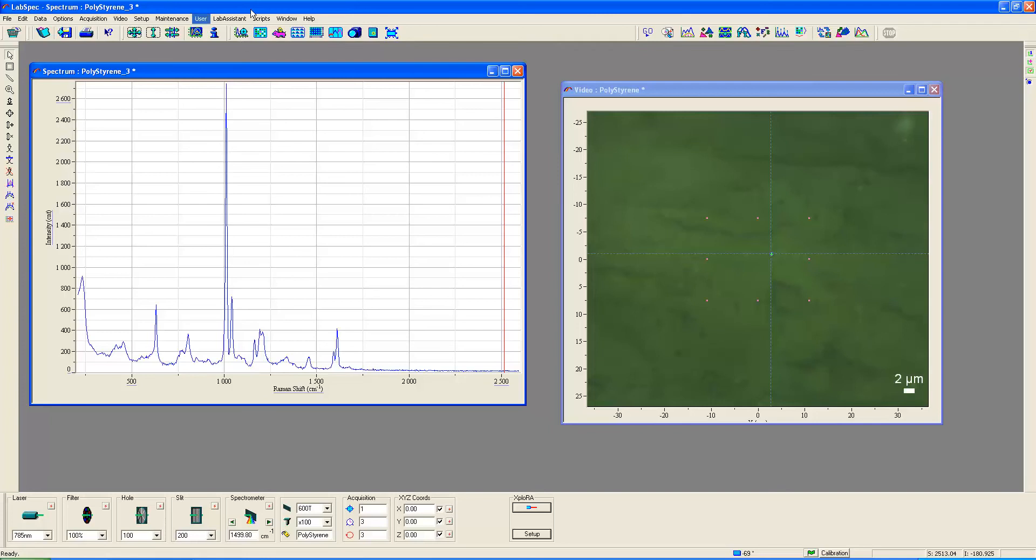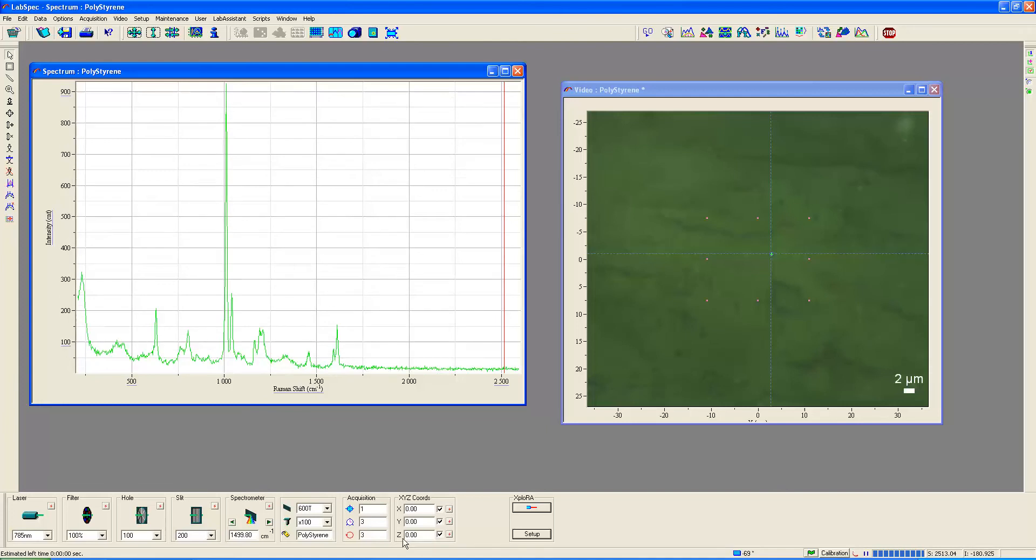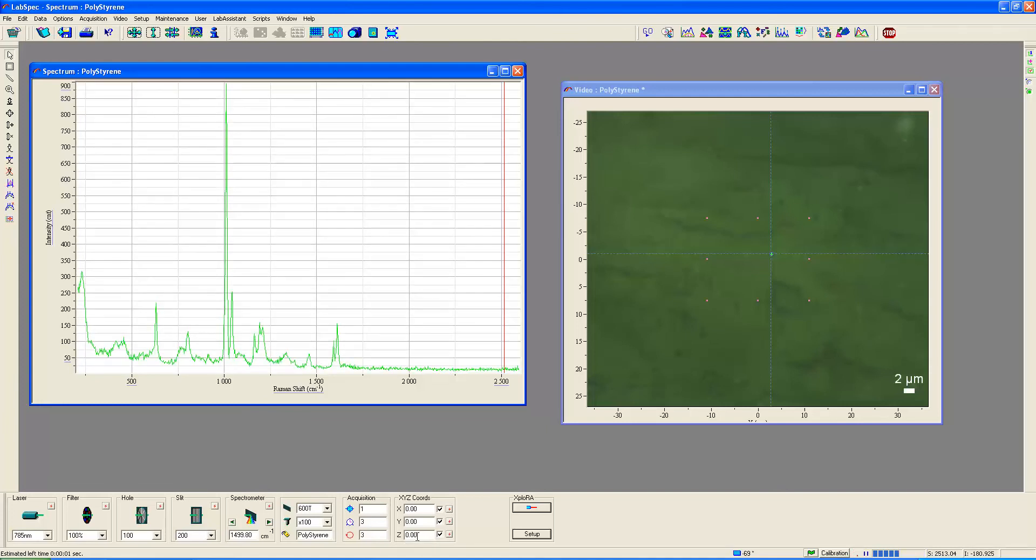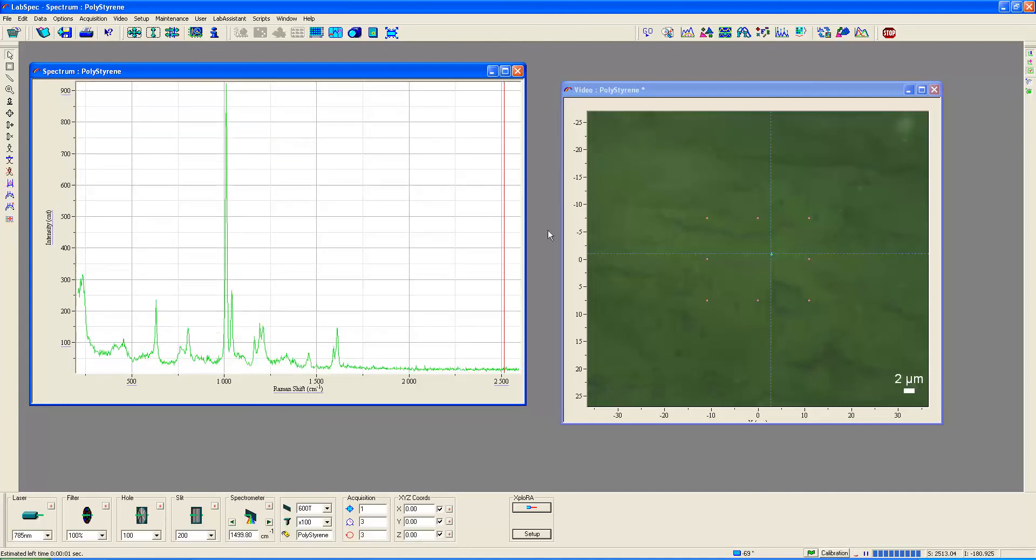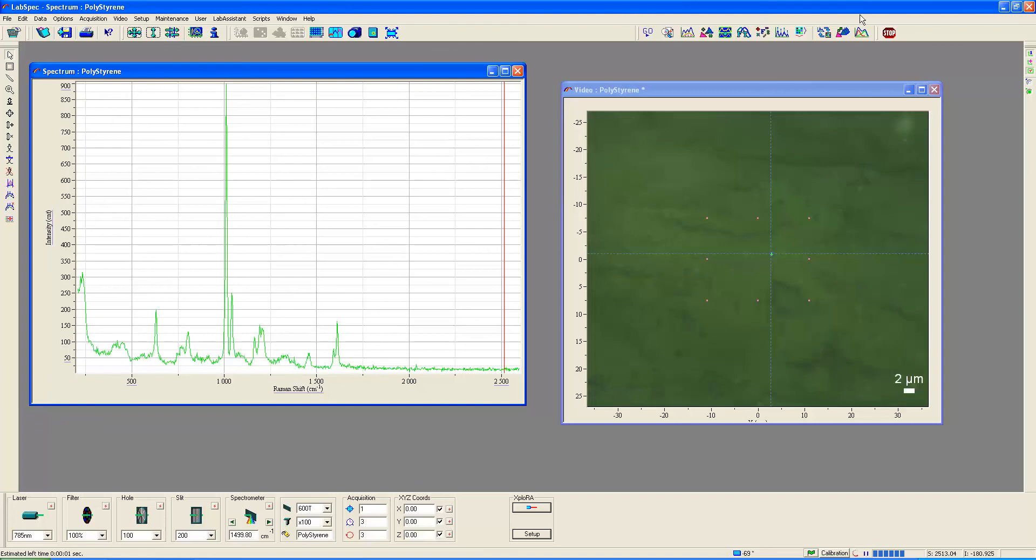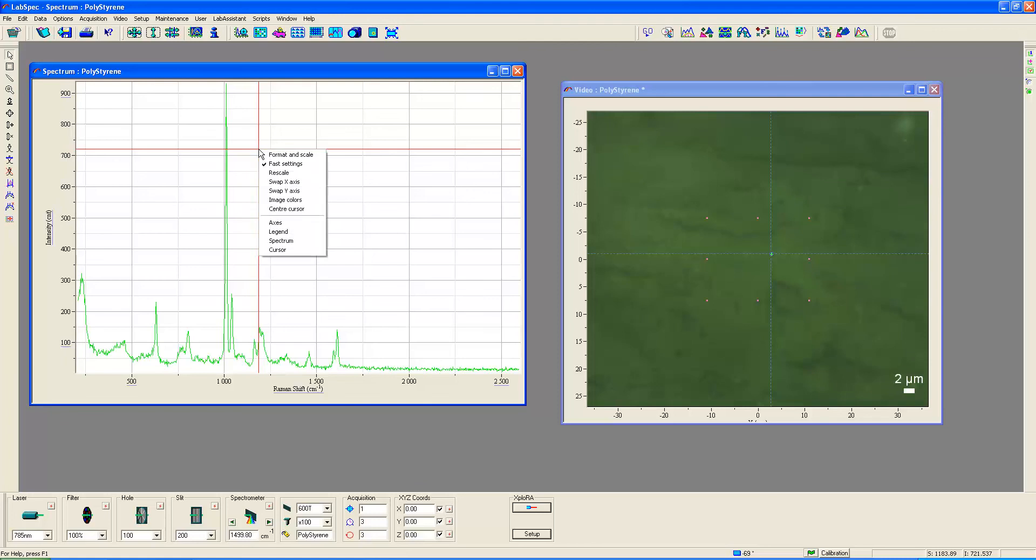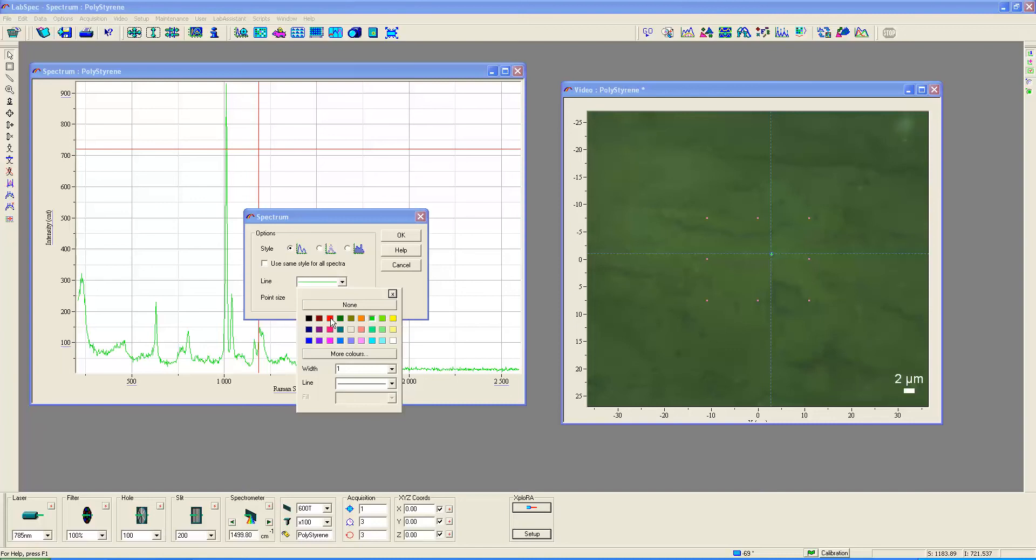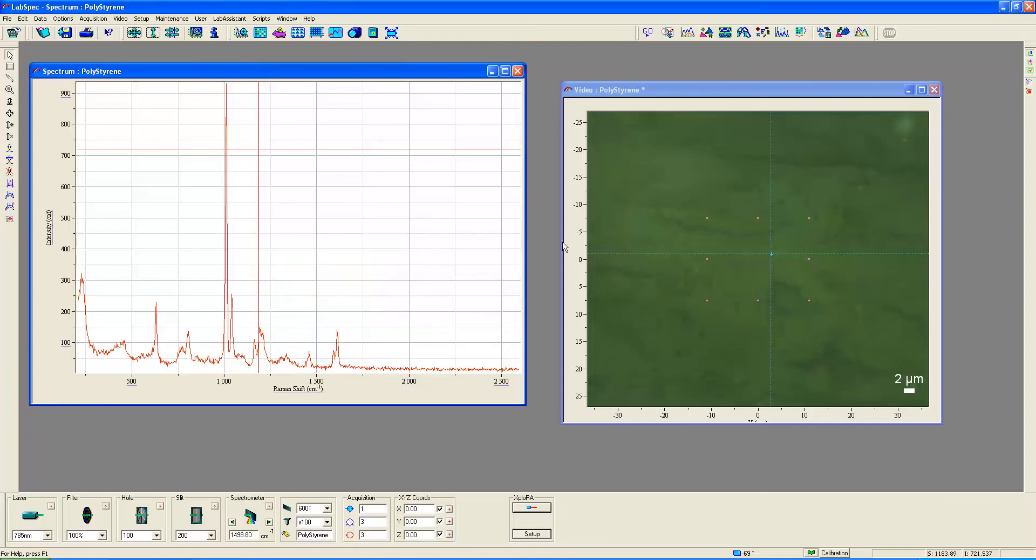Now, let's go back to real-time display. And what I'd like you to do is note the Z position. I'm going to be moving the stage up. I want to change the color of the spectrum to something a little easier, a little better contrast for all of us to see. I'll change it to red.